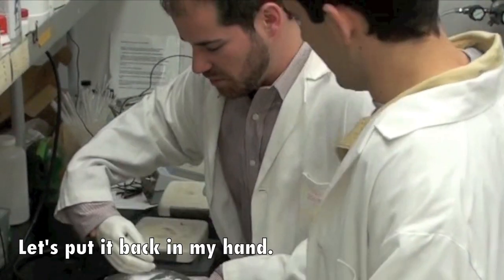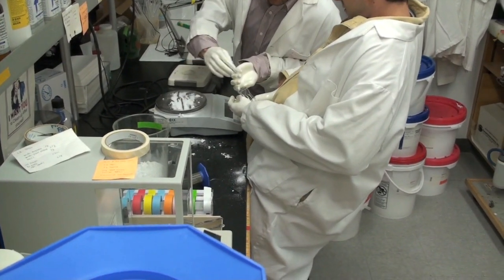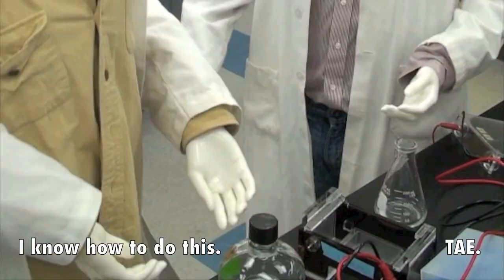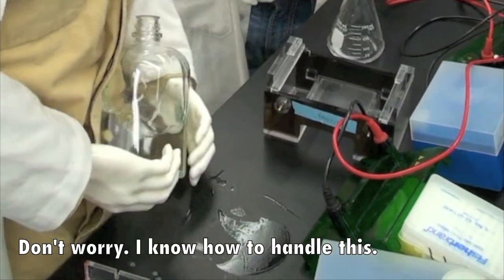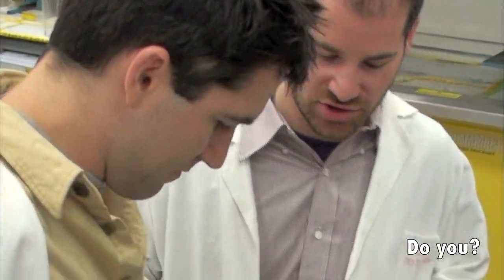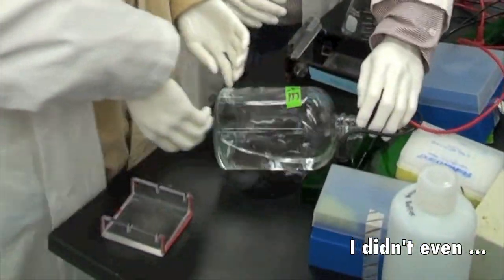All right, we got it. Let's put it back in my hand. Here. I think I got a little bit. Here, just put it here. Perfect. So now we just need to add TAE. You figured out which one's the TAE. It's also made of glass. Don't worry, I know how to. Are you strong enough? Yeah, I go to the gym all the time. Do you? Barely in lab. This is great. All right, stop. It's perfect. How did you know exactly how much to add? I didn't even tell you.